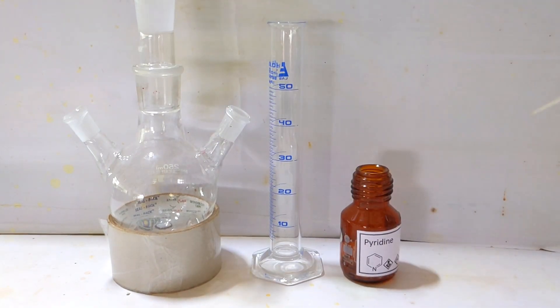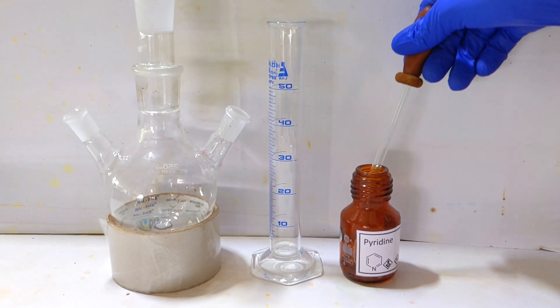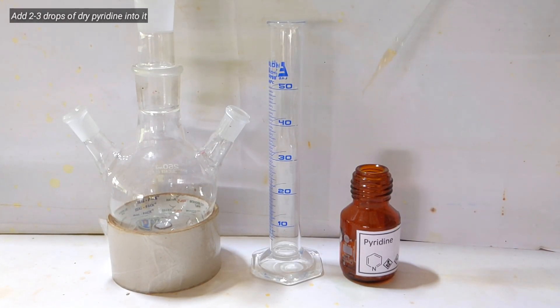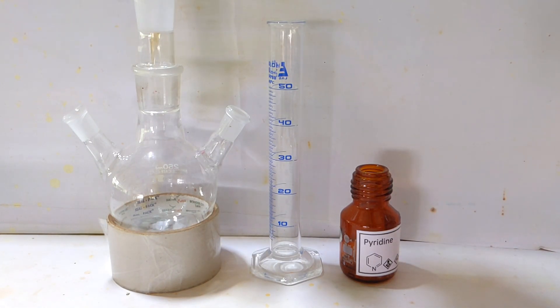Now I add 1 to 2 drops of pyridine using a glass dropper. This was synthesized a few days back by the decarboxylation of niacin, and I have done a video on that you can check out. Pyridine is a halogen carrier; you can also substitute that with iron powder, around 1 gram.